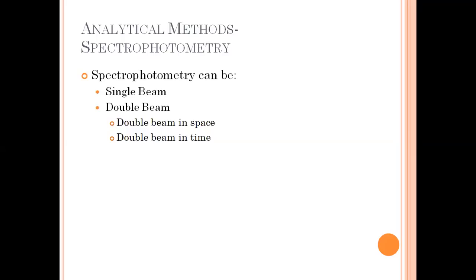The advantage of a single beam is that it is less expensive and at the same time less complicated. Unlike for the double beam, the advantage naman of the double beam is that the reference reading or the control solution reading, the standard solution reading, and sample reading can take place at the same time.